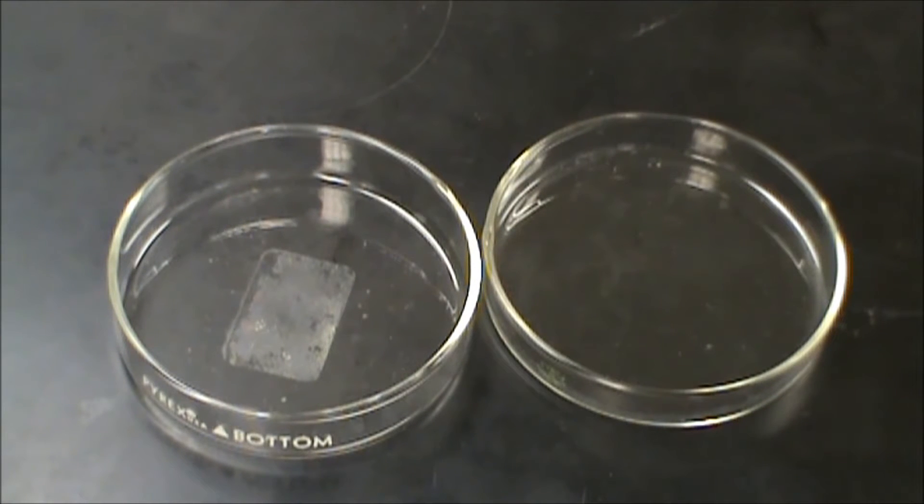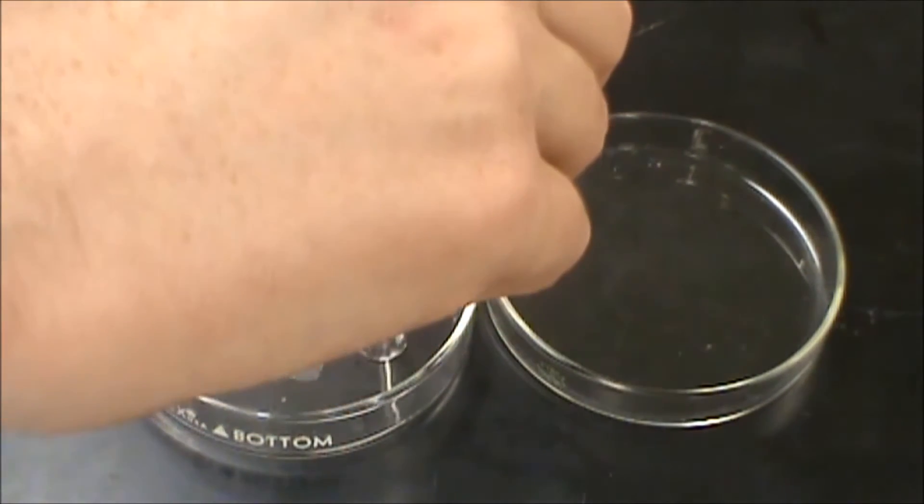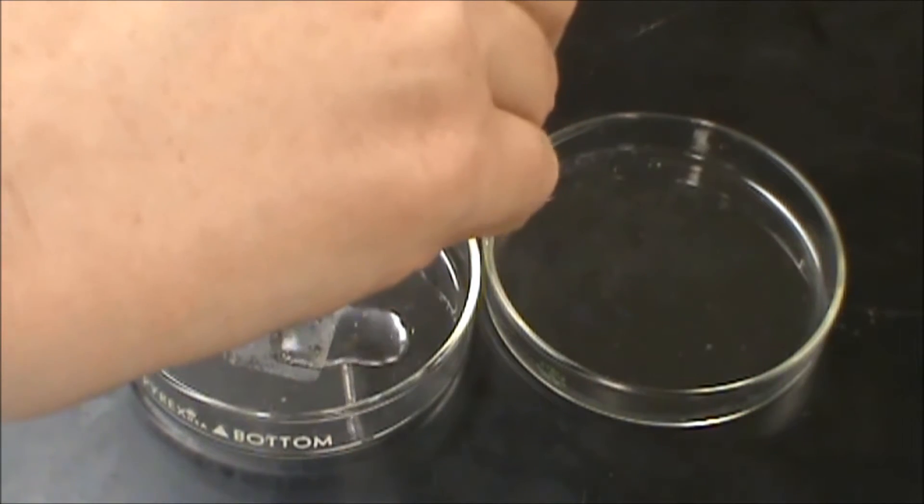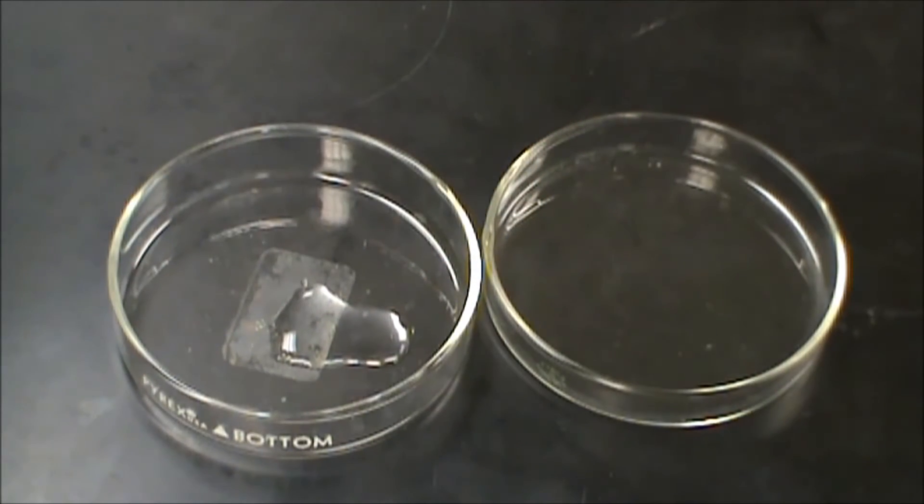We're going to do a little demonstration of amphoteric. What I'm going to do is take a milliliter of zinc nitrate, put it right there, and then I'm going to take another milliliter and put it over here. We're going to show how a compound can be both an acid and a base.